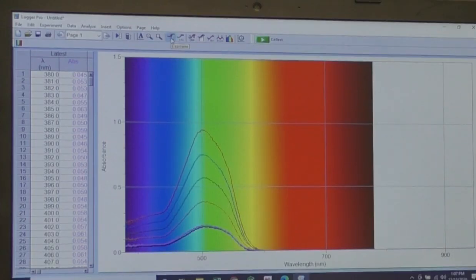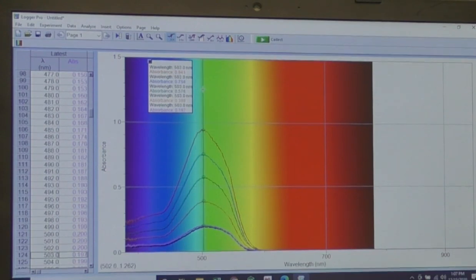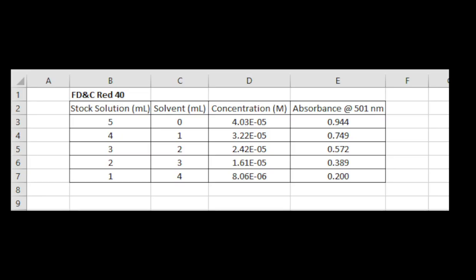Once you have absorbance readings for all your solutions, click the Examine icon and move the line to the point of maximum absorbance or lambda max. You will be able to see the absorbance values for all the solutions. Transfer these values into your Excel table.